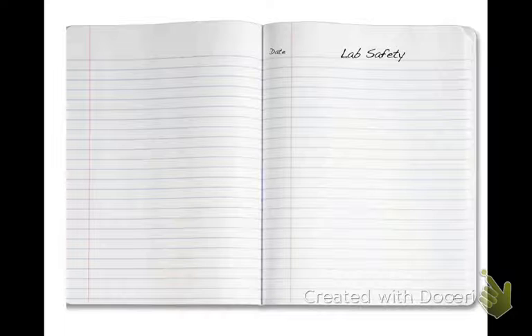In the bottom right-hand corner, I put down a 1. That's your page number. So the bottom outside corners are your page numbers, so I put a 1 there because that's how you're starting. And on the top outside corner, that's your lab number. So in this case, it's going to be lab number 1, or entry number 1.